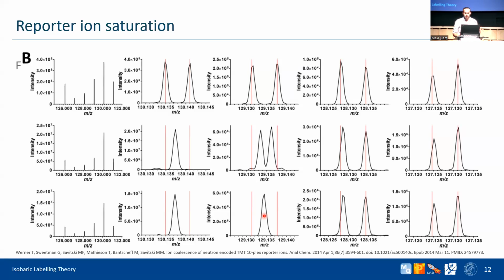If you have too many ions, then what can happen is that the peaks will just overlap each other, and you won't see the 6 millidalton difference between your channels. So another thing to consider when you set up your method, right? When you're setting up the method on the machine, you reduce your maximum ion target from the default to 2E5 or 1E5 or whatever works for you best. Otherwise, you might be losing some of the signals there.